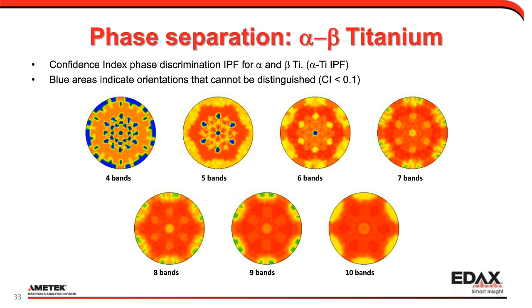Do I have that on my slide or not? Give me a second here. Again, it's a really good question of how to do reflector characterization or optimization, which is something I didn't really cover in this webinar. Let's see if I can find what I'm looking for in my existing slides. It has to be here somewhere. There's this thing called band detective that can help you do this.